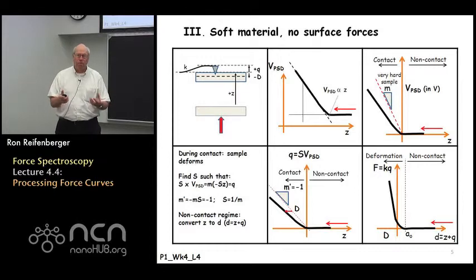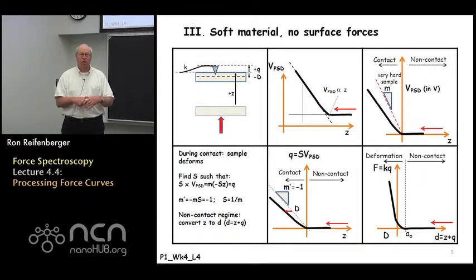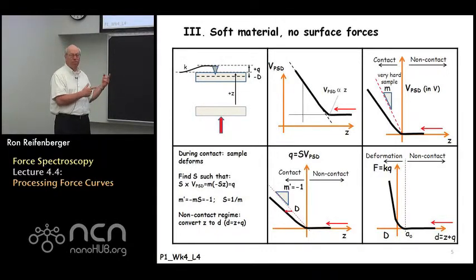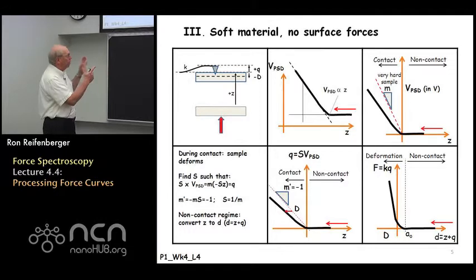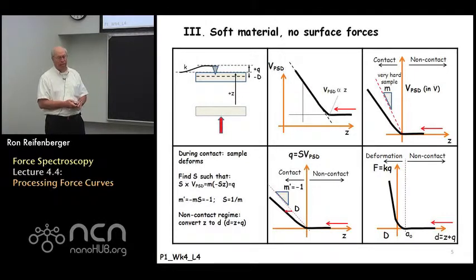It becomes very helpful if you have a simulation tool to help go through all this arithmetic so you don't have to think it through every time. And of course, that's what VEDA is going to offer, right? In the fifth week of part one of this course, we'll talk about VEDA simulations of these parameters, where you don't have to worry about all these details, but you can just click on buttons and get accurate numerical simulations in a matter of seconds.